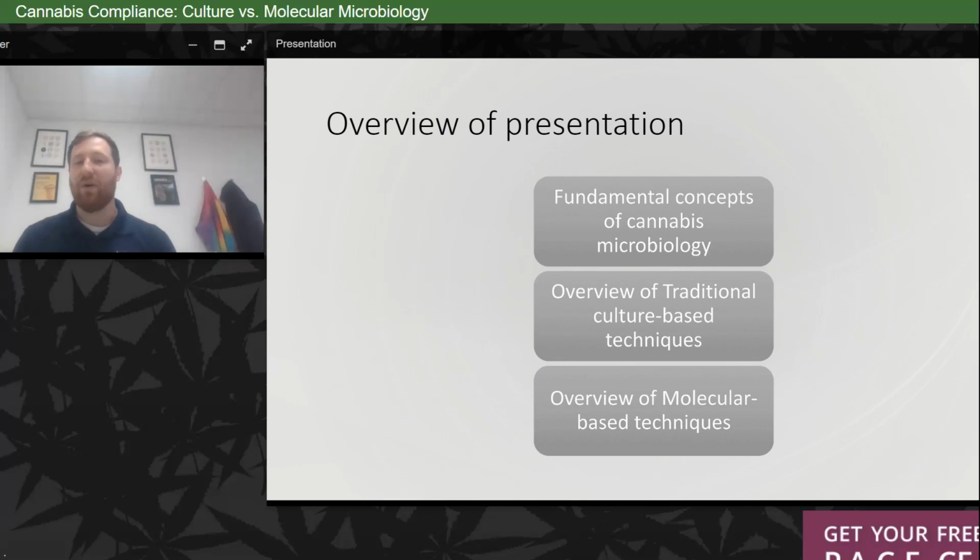A quick overview of what we're going to talk about today. First, we're going to go through the fundamental concepts of cannabis microbiology. Second, we're going to go over the traditional culture-based techniques, and then an overview of some of the molecular-based techniques that are on the market currently. As things change in the market, it's good to understand two different types of microbiology. First, culture-based, what some people call media-based, and secondly, the fast molecular methods.